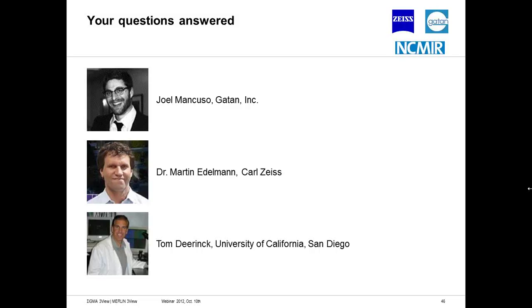Then a question, Joel, this is something you can answer. I've read that there are 2 versions of 3View. I think it is about 3View and 3View XP. Could you comment on this? When do I choose which version of 3View?